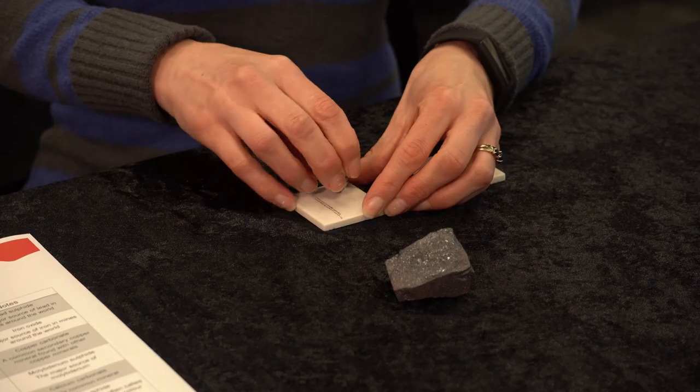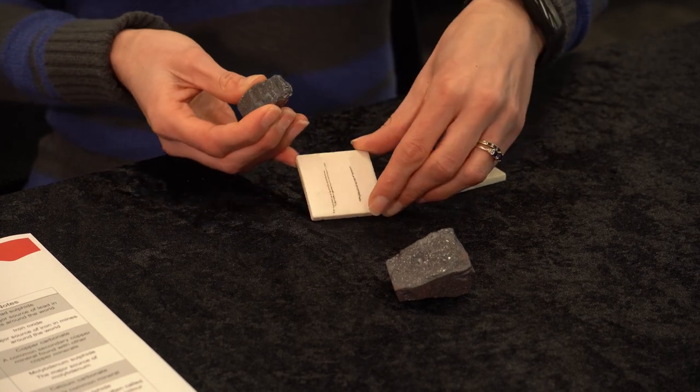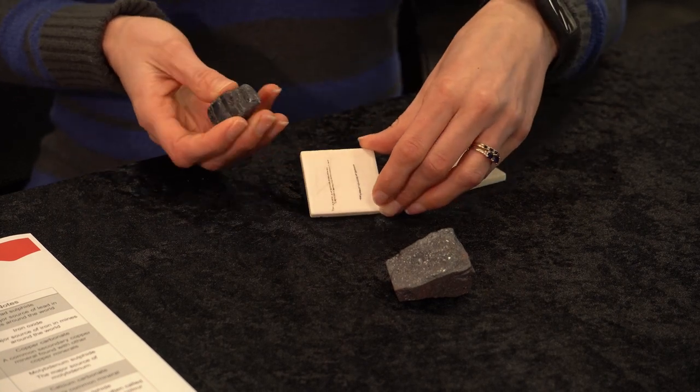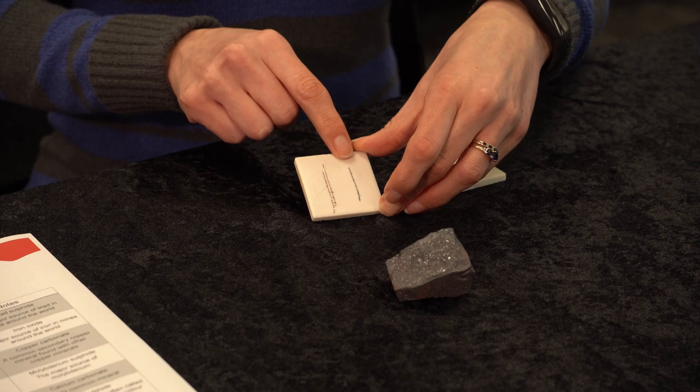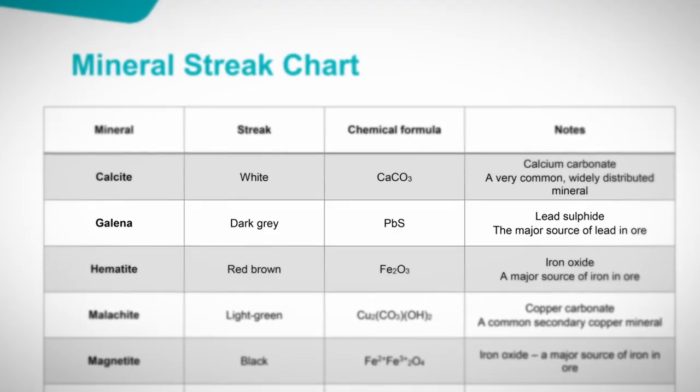If I do the same thing with my second sample — hold the streak plate firmly, run the sample across — this specimen leaves behind a dark grey streak. If I use my mineral identification chart again, a lead grey streak suggests a sample of galena.